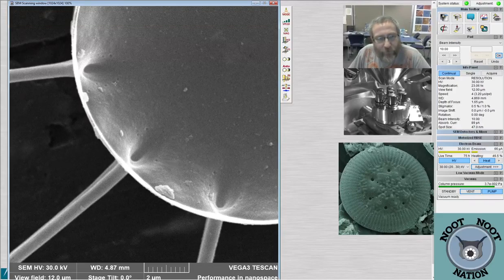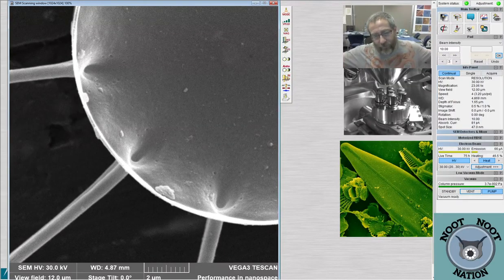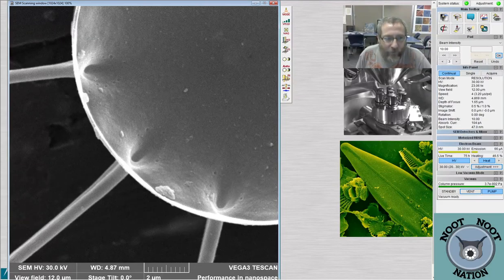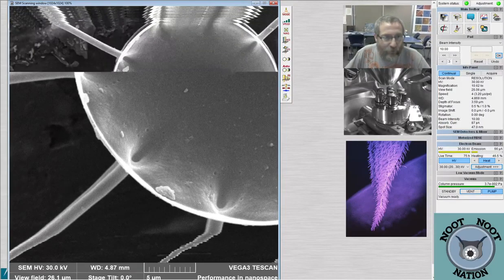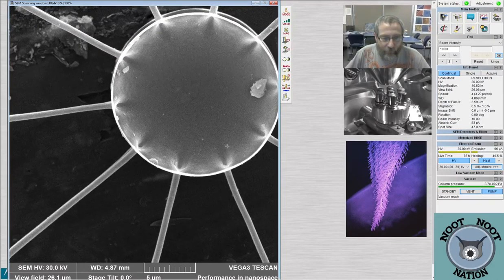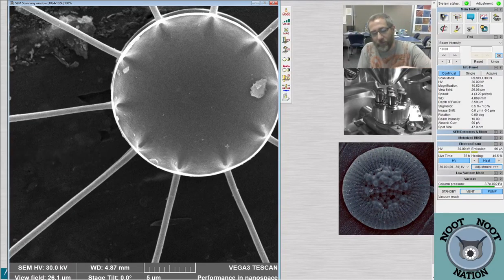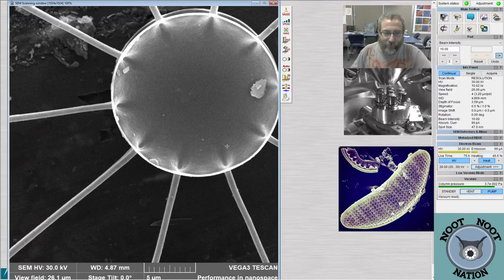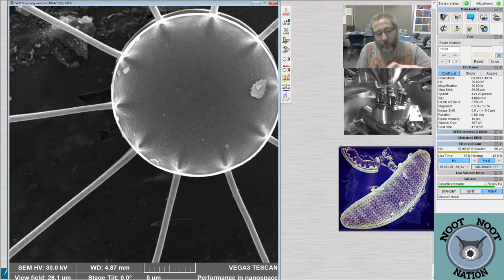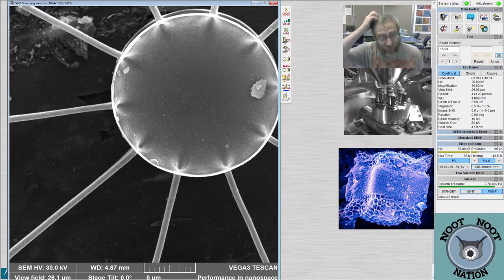And what they do normally when you have these things, which are called setae, not spines, they put their chloroplasts out in them, and because they're plankton, as they fall through the water column, they have more surface area. And the reason they need to do that would be a little more apparent if we had the colony, because they grow in a colony. You'd be able to see that the center cells are all together, and if you push all of your chloroplasts out to the outside edge, then you have surface area at the outside edge where you're not being interfered with by the rest of the colony. So even though they're transparent, if you put all your chloroplasts in the center, the light that's transmitted through them wouldn't get all the way through as easily.